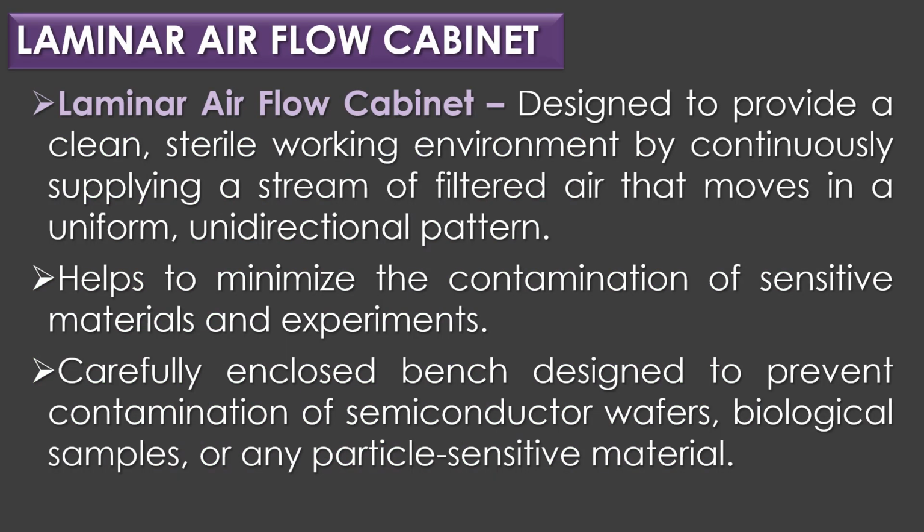Laminar airflow cabinet. A laminar airflow cabinet is a laboratory equipment designed to provide a clean, sterile working environment by continuously supplying a stream of filtered air that moves in a uniform, unidirectional pattern. Laminar airflow cabinet helps to minimize the contamination of sensitive materials and experiments. A laminar airflow cabinet is a carefully enclosed bench designed to prevent contamination of semiconductor wafers, biological samples, or any particle-sensitive material.